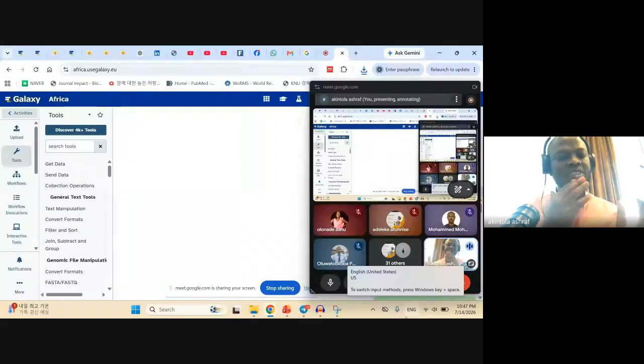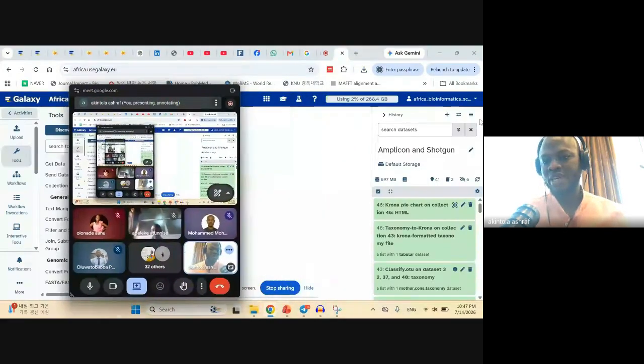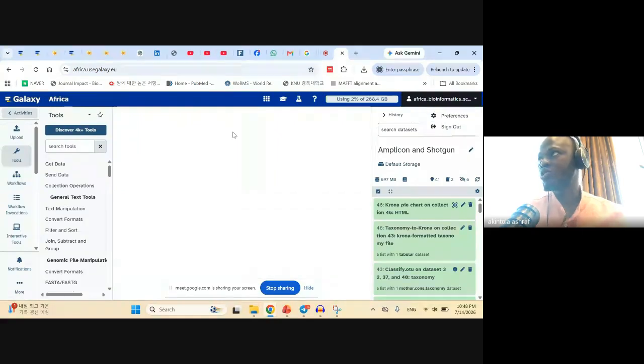I've already registered my own account on Africa Galaxy. But if you are just starting out, you have to create an account.